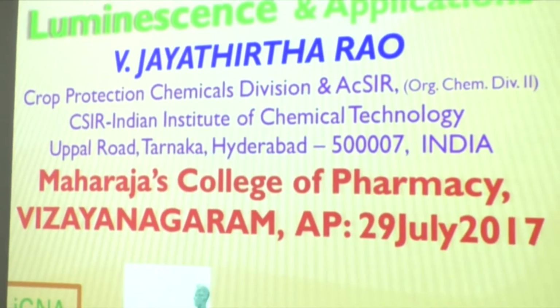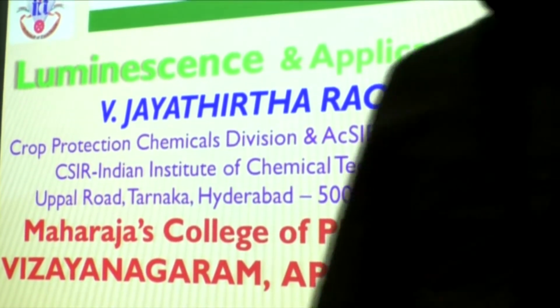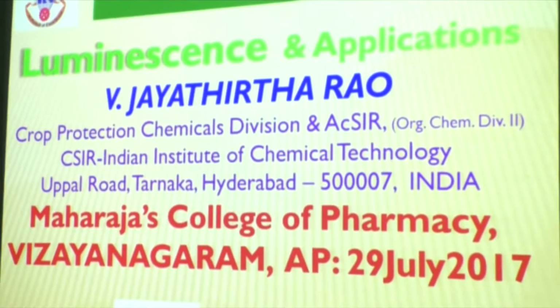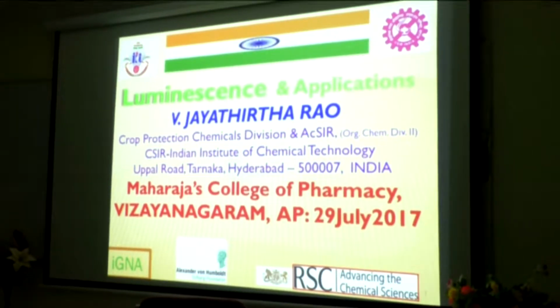Right? So, what I will be speaking to you about is luminescence. This is one of the techniques which is used extensively. I will take it to the real-time application. There you will have a fantastic appreciation.